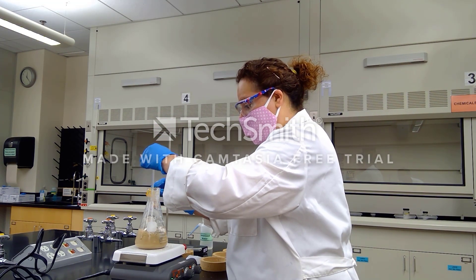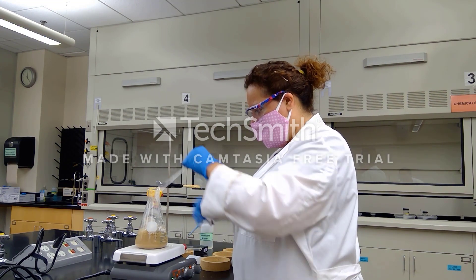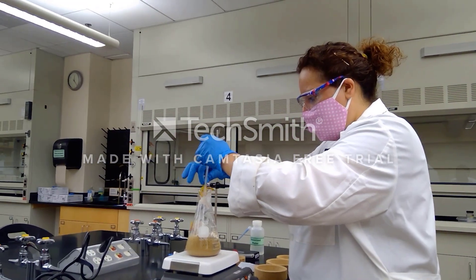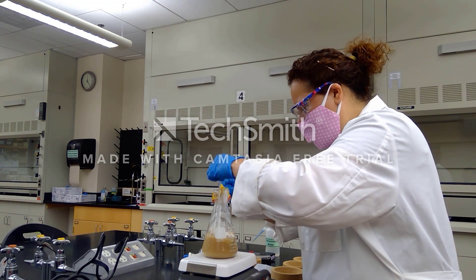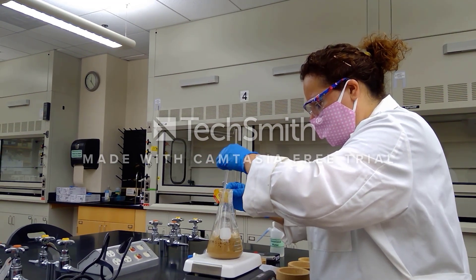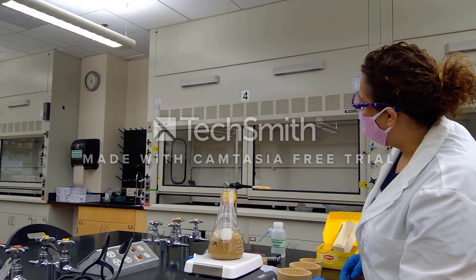Calcium carbonate is a mild base and we will see that our solution here is going to be a very creamy looking color at the moment thanks to the calcium carbonate. Now that I've got all my tea bags in, I'm going to make sure that they are nice and wet and I'm going to take a quick look at the clock just to ensure we can measure 20 minutes of time.